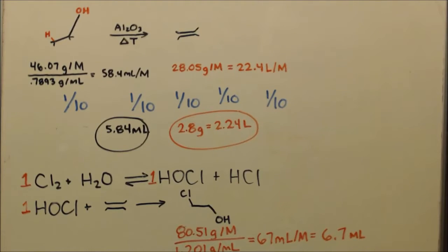Alright, I'm going to try to make some ethene today. In the beginning, I made propene from isopropyl alcohol, and I'm going to make it the same way I did there, with aluminum oxide as the dehydrator. It's basically a catalyst. You know what I mean? It doesn't get used up, theoretically.